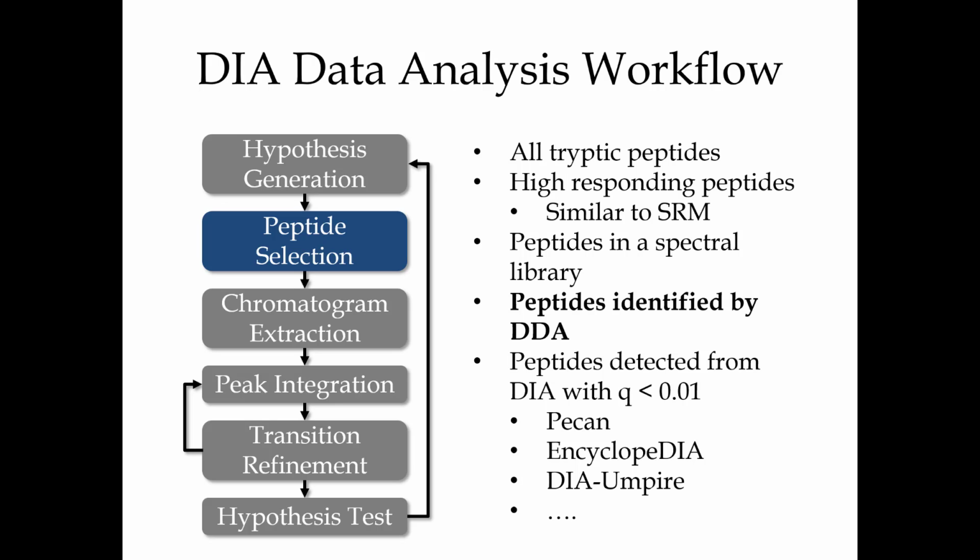With DDA data, you can't get fragment ion chromatograms, right? So you can only quantify off the MS1. So if I use DDA data to inform myself, and then I go do PRM or SRM, we all know that's going to give us way better quantification than MS1. The extra level of separation using the fragment ions gives us better quantitative data than MS1.